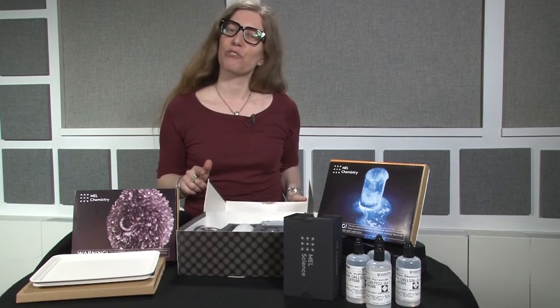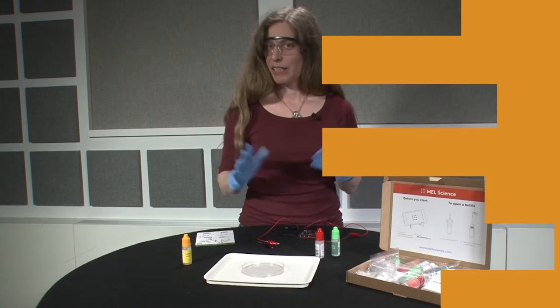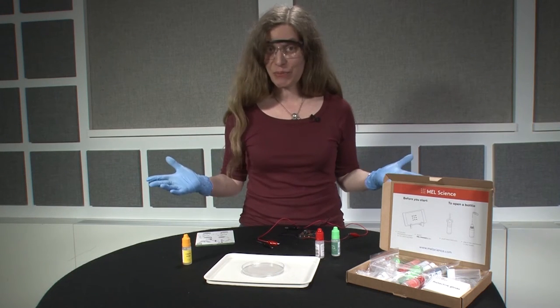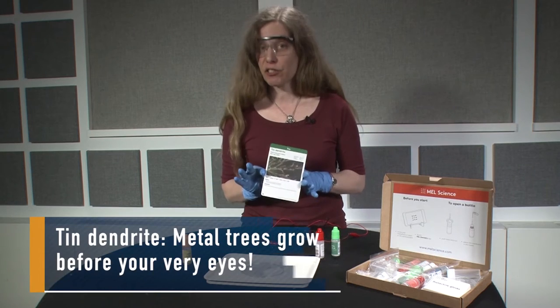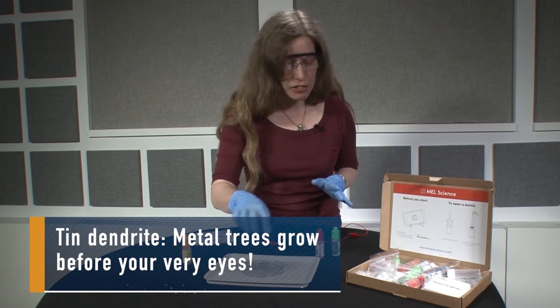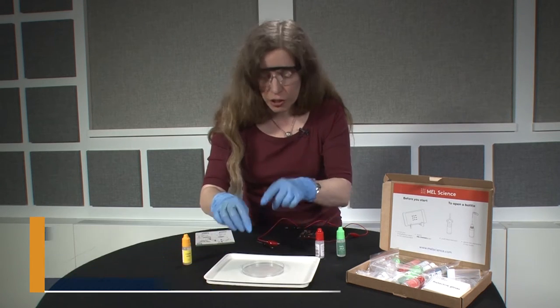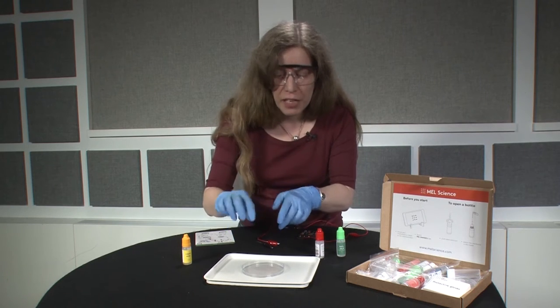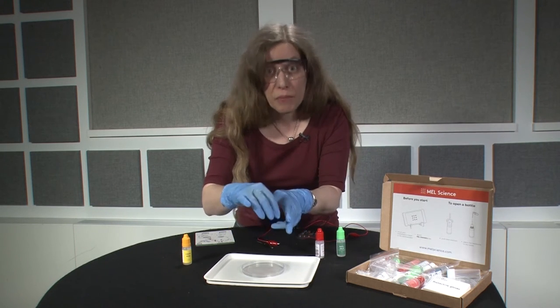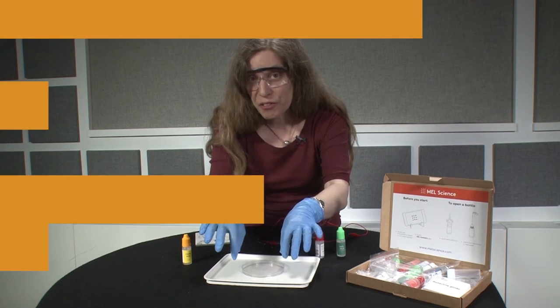Why don't we take a closer look at one of the monthly experiments and have a little fun? I've got my protective gear on — let's do some science. We're going to be doing an experiment from one of the monthly kits called Tin Dendrite. We're going to create a solution in this dish using tin chloride, then charge it with an electrical current, and over about 15 minutes these little branching structures from the tin are going to start forming and extend from one clip to the other.